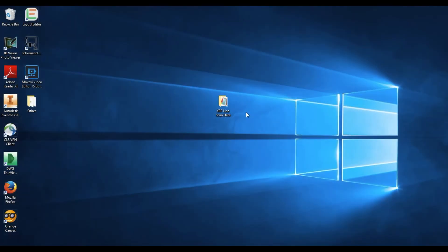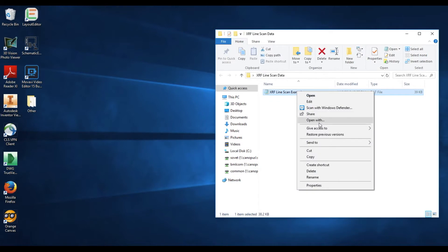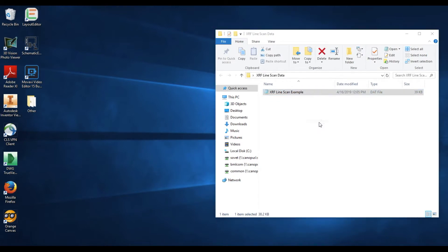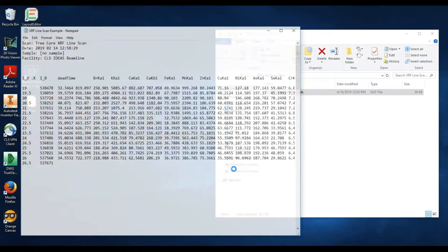To create an XRF line scan graph from XRF data acquired on the Ideas beamline of the Canadian Light Source, open up the folder containing your data. Right-click your data file and select Open With. Choose any text software you're comfortable with. Notepad is probably the easiest to use. Select the software and select OK.